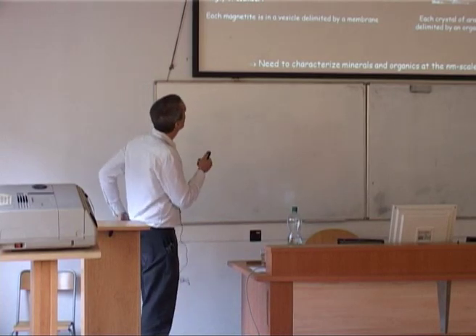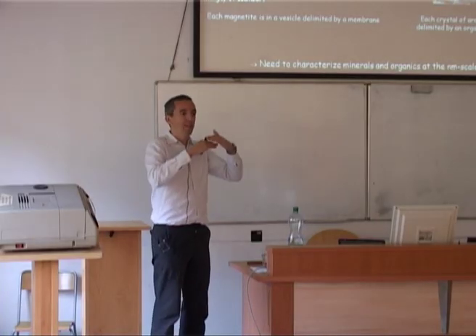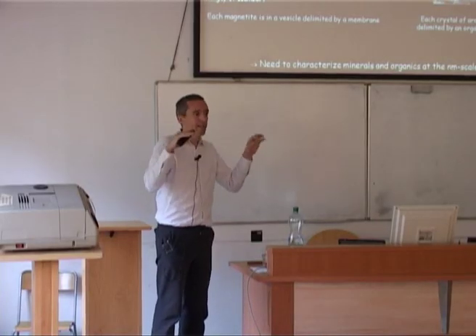The second thing is that all those crystals, so this is nacre. Nacre, this is SEM. You see the tablets here are aragonite crystals, and the tablets are separated from each other by organic molecules.